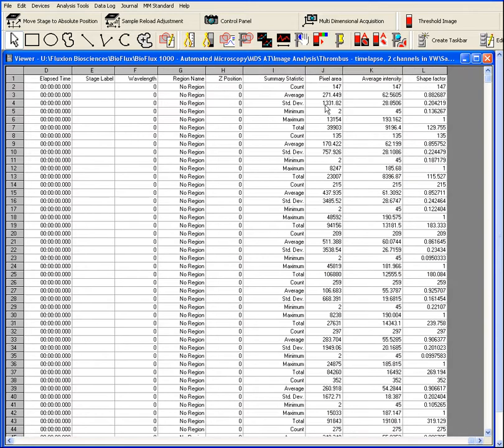And from this we get things like the number of objects, the average intensity, the shape and morphology data. And this data right here is fully customizable and editable so we can make sure that we record the fields that are of interest to the particular analysis.